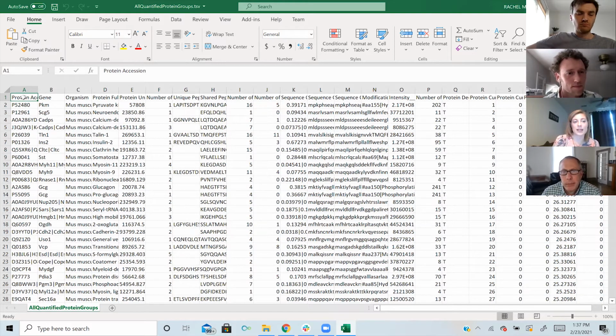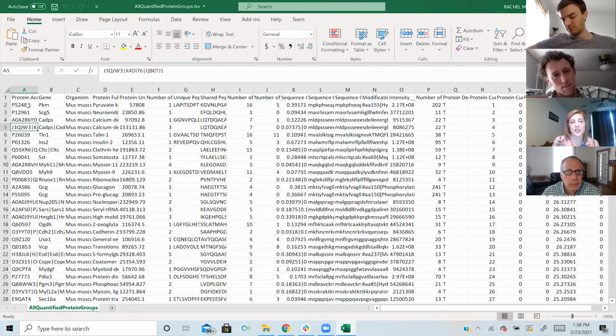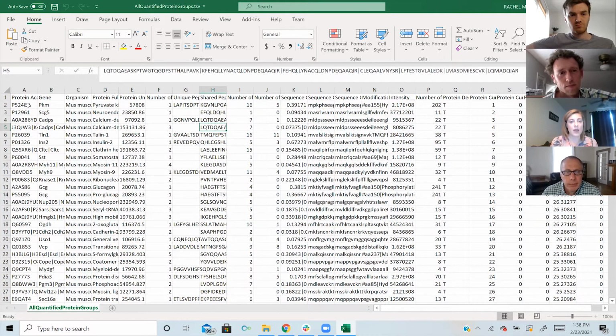So we have the protein accession. So here, we are able to determine that this single protein is in our sample, or this is how we display protein groups. So these 3 protein accessions, we can't distinguish based on the peptide evidence that we have if one is in the sample, if it's a subset, or all of them. So we display all equally here. And this is the shared peptide support for that.